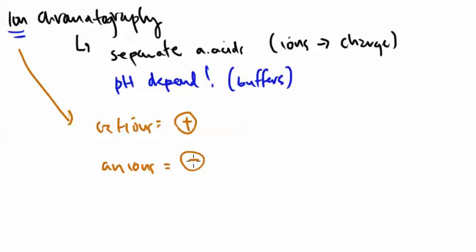So chromatography has kind of opened its door up to everybody that wants to participate. The only thing is that you've got to choose the correct stationary phase. So here again, just like with TLC, we have a mobile phase in place and we have a stationary phase in place. The mobile phase is very similar to what we've discussed with TLC. This is a solution that typically you have made or that you have ordered a standard of.